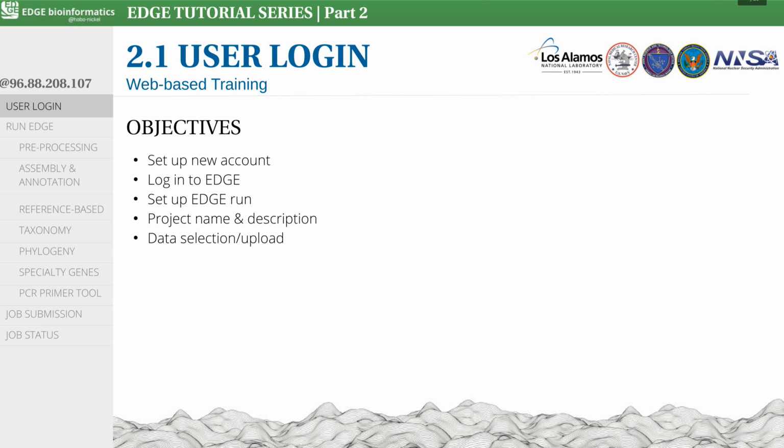In part 2, we dedicate one video to each EDGE module. In this video, I will demonstrate how to access EDGE through a web browser. After this tutorial, you will know how to set up a new user account, log in, and set up an EDGE run.